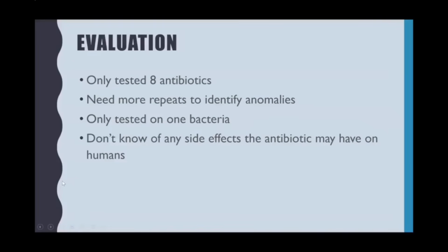Is the evaluation. And by this, what we mean is you've got the conclusion now that STR is the most effective antibiotic for treating or killing E. coli. But you need to consider, are there any parts of your method that make you doubt that? And for me, there were 4 key parts of the method. Number one, we only tested 8 antibiotics, so therefore you can't confidently say STR is the most effective for killing E. coli when you've only tested 8.